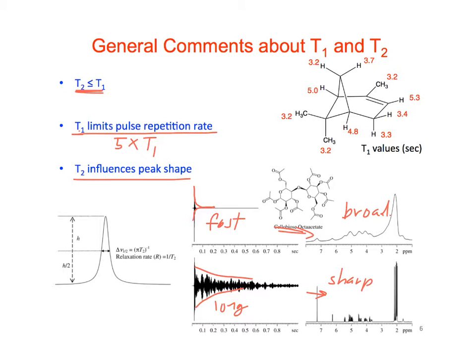You know, shorten the time, and so that way, that 0.1 where it's actually occurring, you can make that your total time of sampling. Yeah, but I think it's not that you're not acquiring a long enough signal, enough data points. It's that it's relaxing so fast.